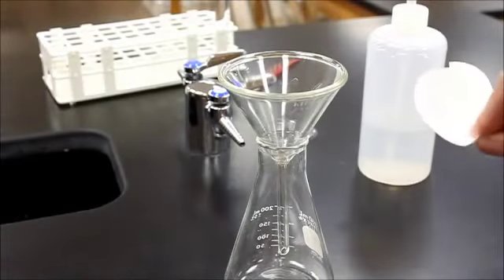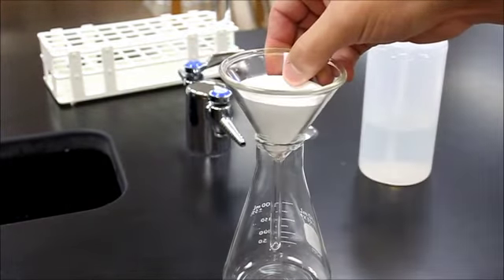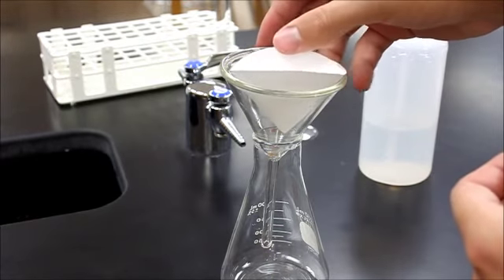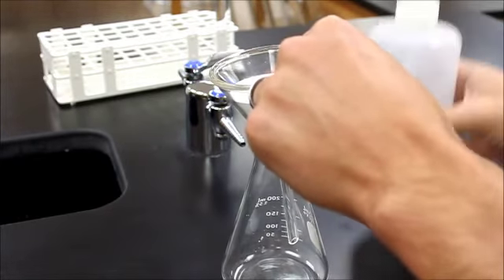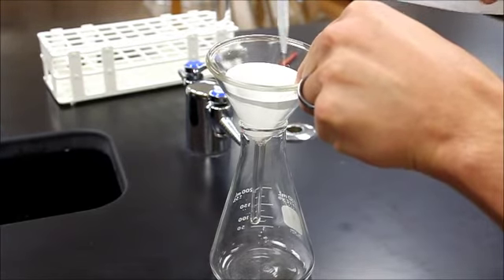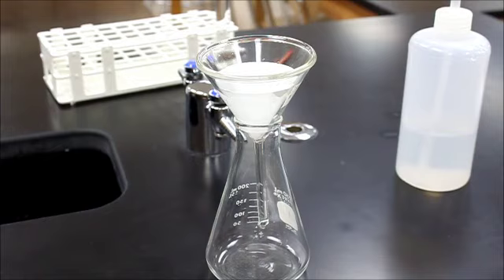Once you have your filter paper all folded, what you're going to do is place that into your funnel that's loaded on top of your Erlenmeyer flask here. Now it has a tendency to try to not stay in that spot. So you're going to push it down and have it opened up, and then you're going to take a squirt bottle of water and squirt and dampen that filter paper. Now some of the water will go down into our flask. Luckily we're not trying to measure anything that's down there.